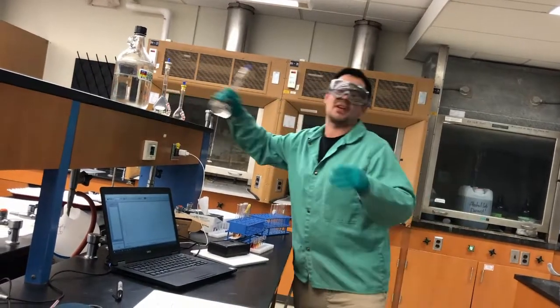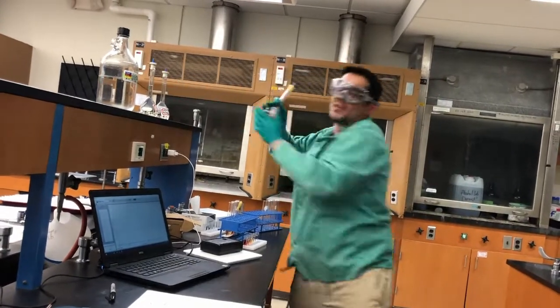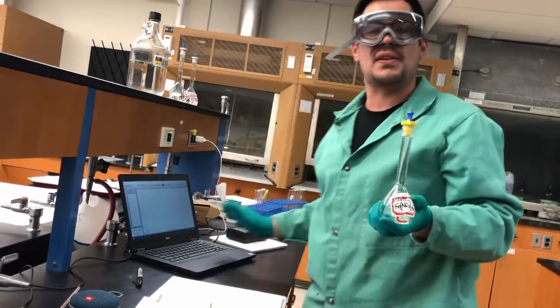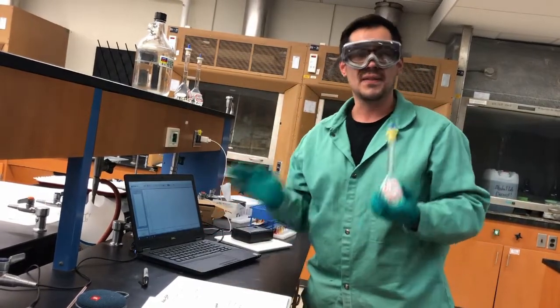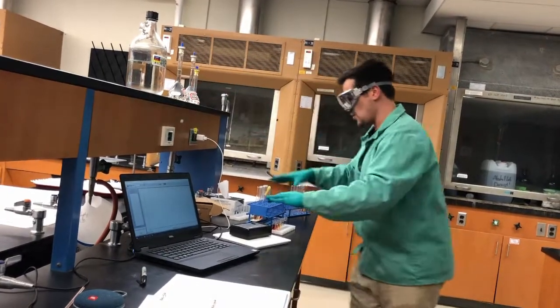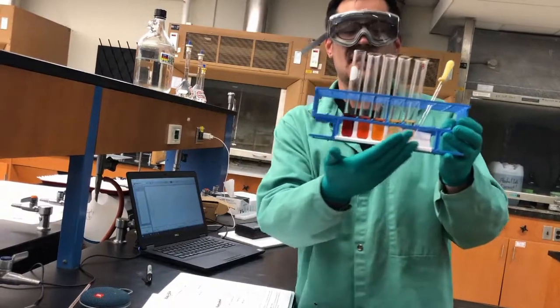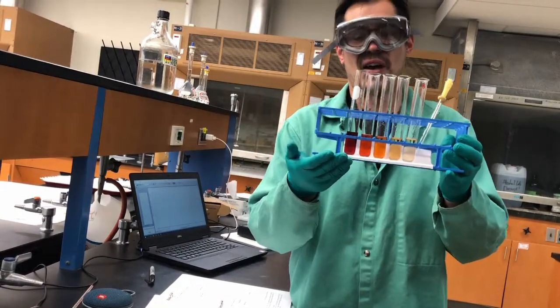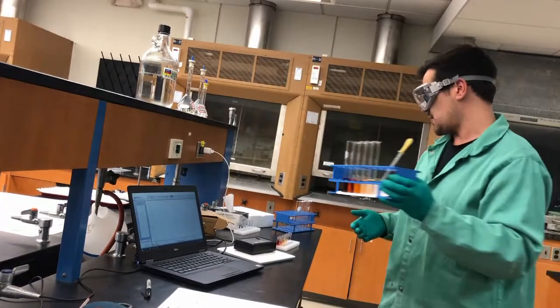So what we did first is we have a stock solution, right? What we did was just create a dilute, which is going to be really nice when we run this doing absorbance, because if the color is too dark, it actually won't read. That's the reason why we're doing that to be dilute. Once you create your solutions, you can see the concentration of the iron increasing as we go from test tube 1 to test tube 5.